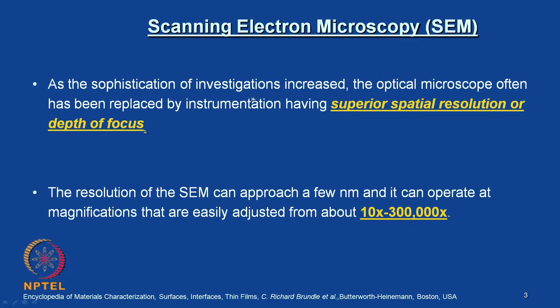As the sophistication of the investigations increased, the optical microscope often has been replaced by instrumentation having superior spatial resolution or depth of focus. So the resolution of an SEM can approach a few nanometers, as I mentioned, and it can operate at magnifications that are easily adjusted from about 10x to 300,000x. Of course, this is subject to instrumentation. We will talk about it at an appropriate time.